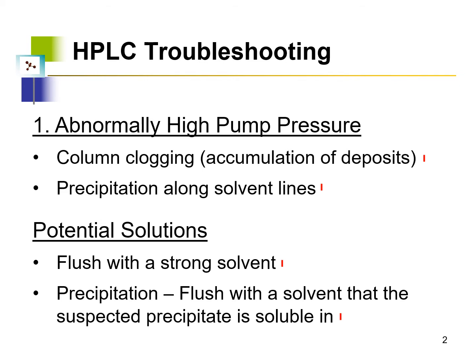The solution to clogging is to flush the column and lines with solvents that can dissolve the blockage species. If salt precipitation is the issue, we flush with water since salt dissolves in water very well. If the contaminant is dissolvable in an organic solvent, we flush with that organic solvent — it could be acetonitrile or methanol and so forth.